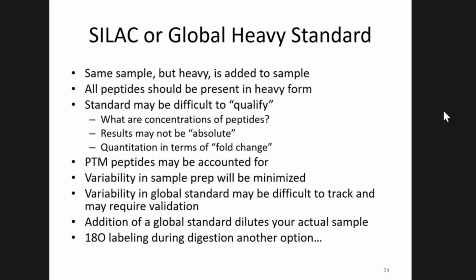Some people think that absolute implies that you can get an intensity and report a concentration, simple as that. And obviously that's not straightforward. All of our quantitation, by definition, is relative to a standard, right? So I always consider it precise relative quantitation rather than absolute. We can do a lot of debating over beers in a bar about that later.